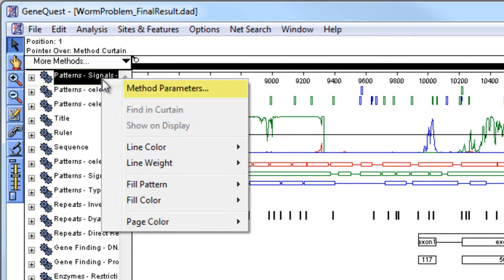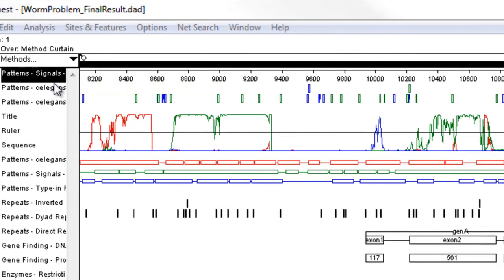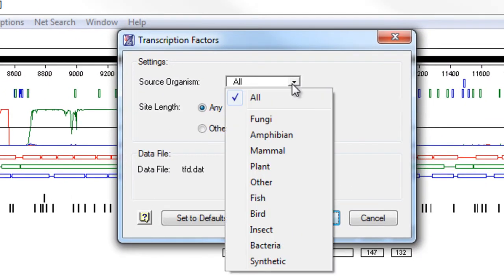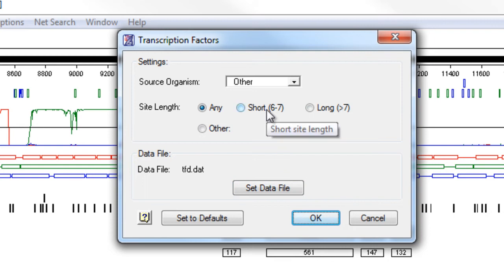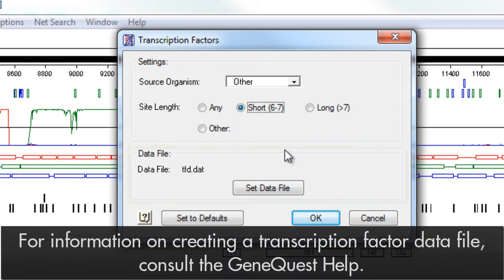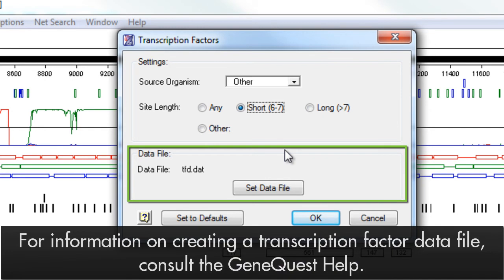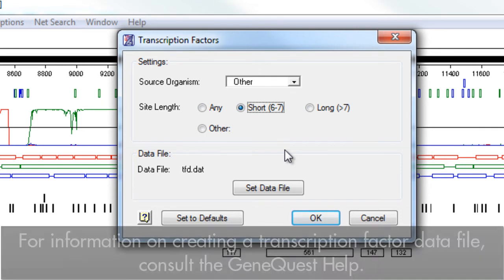Right-click on the method and choose Method Parameters to change which source organism to search. In this case, I'll choose Other, and for the site length to search for, I'll choose Short. By default, GeneQuest uses the TFD.dat file installed with LaserGene for all of the source organism and site information. However, you can use your own transcription factor database if you have one.